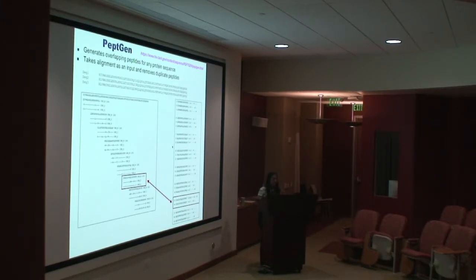Then you will actually get, so 2 things you need to put in. You need to put in how long you want those sequences, the generated peptides, to be, and also how much overlap you want. So if the length is 15 and you have an n-1 overlap of 14, essentially you're going to get the whole thing, representing the whole sequence, but that's not what most people do. It's usually 15 overlapping by 5 to 7 or something like that.